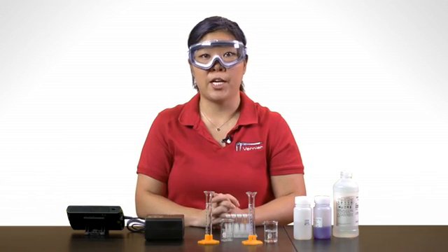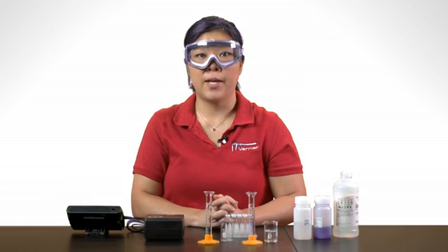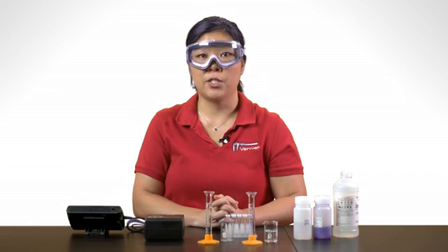We're now ready to run the reaction and follow the color fading by measuring the amount of light of a certain wavelength as absorbed by the purple mixture. Mix and measure an amount of the reactants and transfer some of the reaction mixture to a cuvette, then place the cuvette in the colorimeter and start data collection.